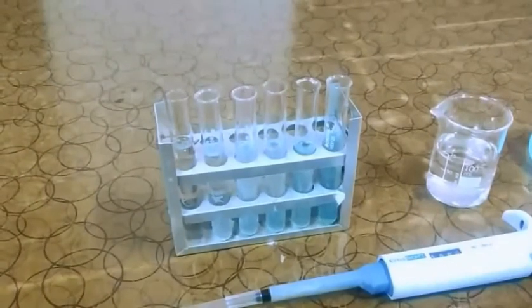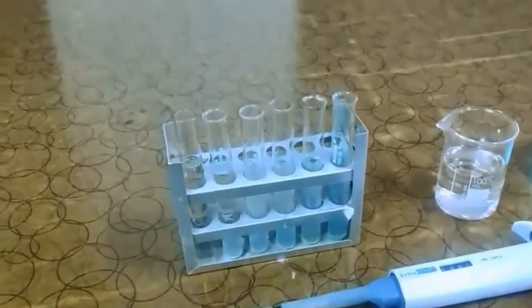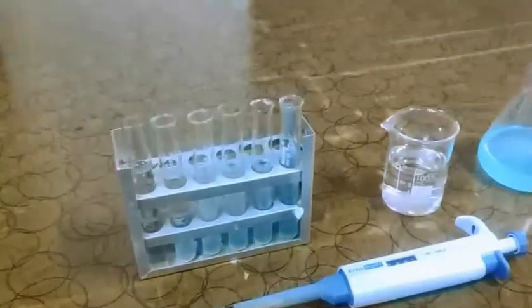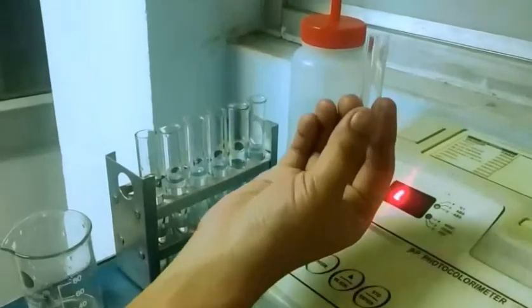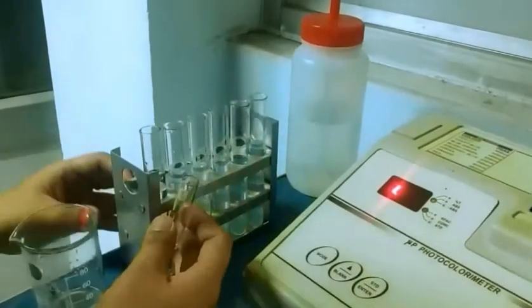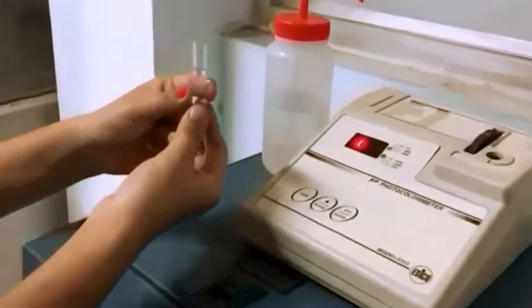I'm going to measure in a colorimeter, the wavelength will be 530 nanometer, and then I'll be using a cuvette for measuring this. So this is the cuvette I have been talking about. With this cuvette I'll be measuring the optical density of the solutions in the test tubes.